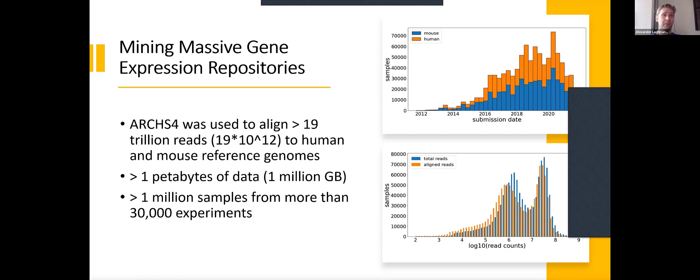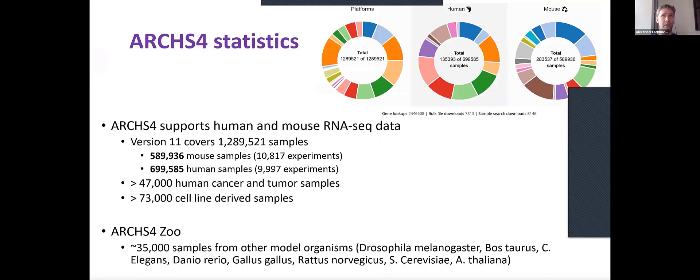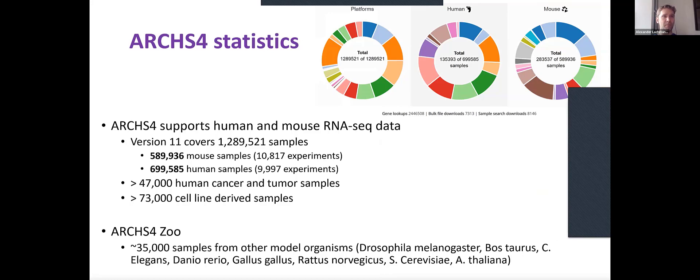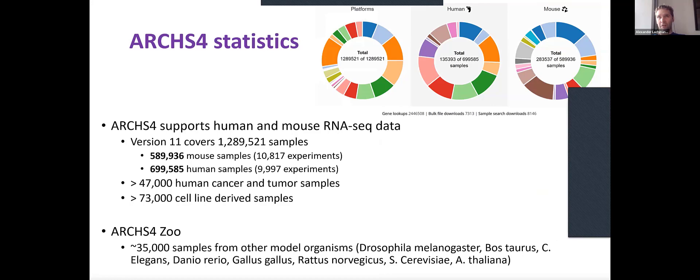It's more than a million samples that we aligned from 30,000 experiments. This is a quick breakdown: we have about 600,000 mouse samples and 700,000 human samples. We also have a couple of samples from other species, but that's a much smaller data set from like six of the most common RNA-seq data sets for other species.